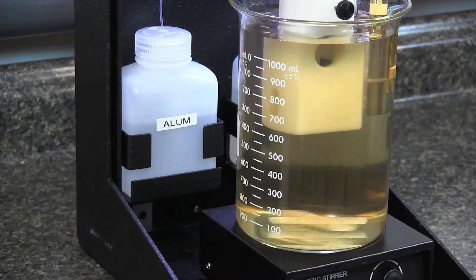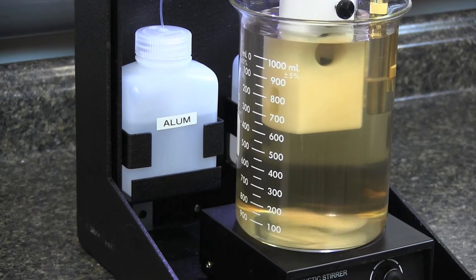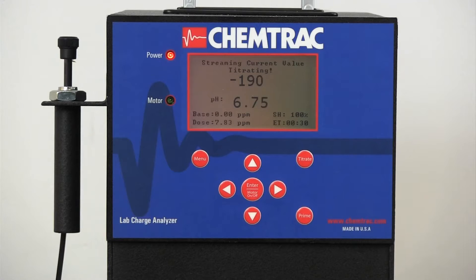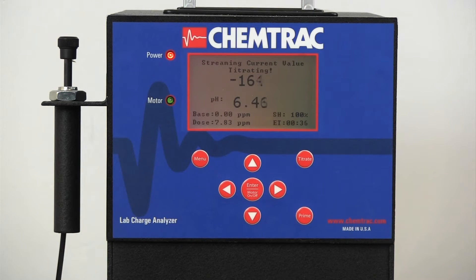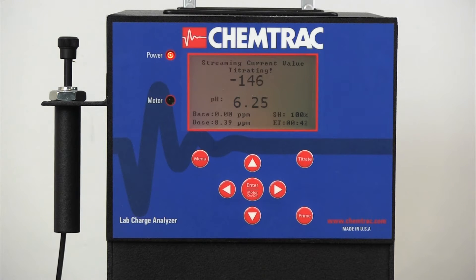As a 1% aluminum sulfate solution is added to the water, the charge reading moves towards zero. The pH is subsequently suppressed due to the acidic properties of this coagulant and the limited buffering capability of the low alkalinity water.